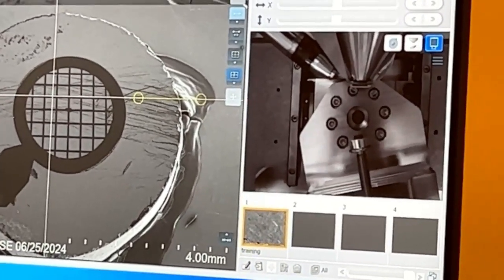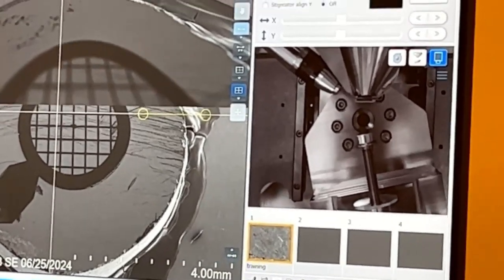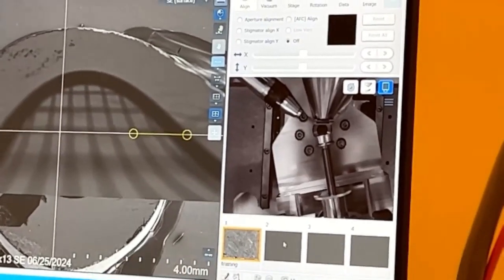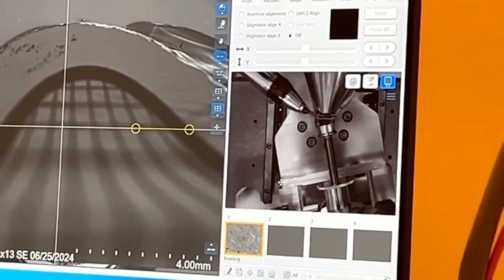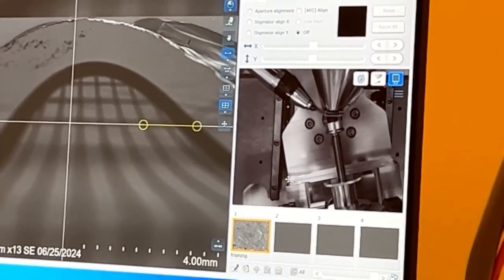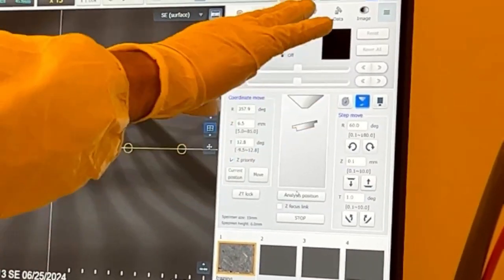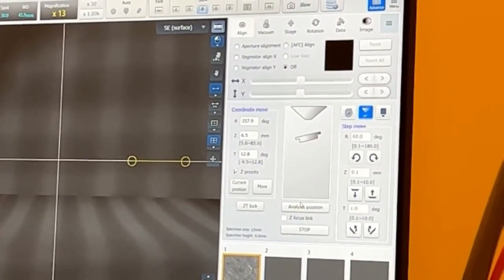You can actually see what's going on. It's still nerve-wracking watching that, right? Woo! Is it too close? No. What did you do? I missed that. I moved it and hit move and then just went back to the camera so we could watch it move in there.